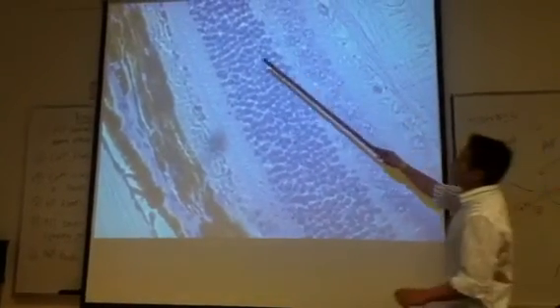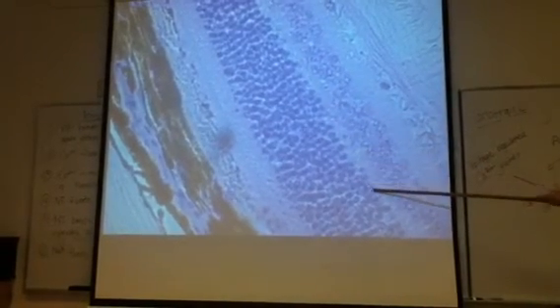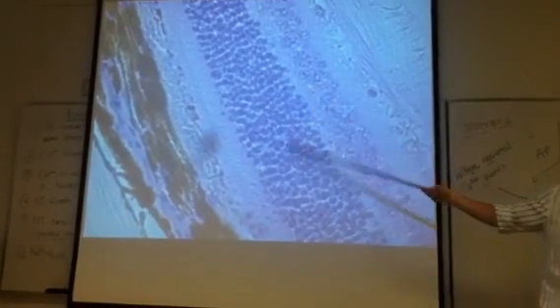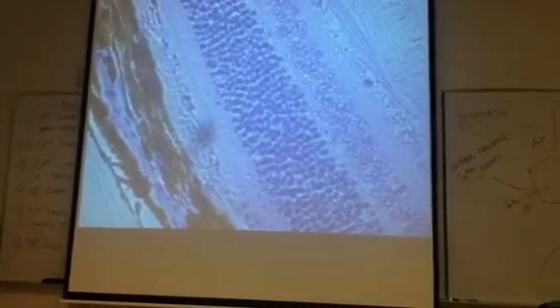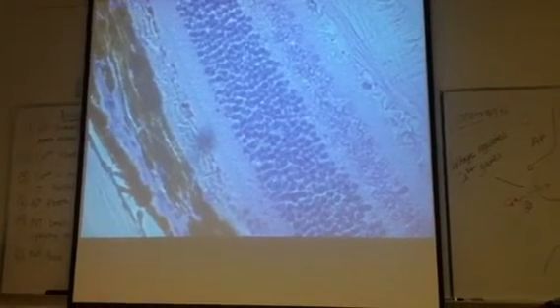Okay. So, you see there's the nuclei of the photoreceptors, the nuclei of the bipolar cells. There's actually a thin kind of layer right here in between the two. That's lighter. That's a lighter color. What structures are found in there? So, the axons of the photoreceptors and the dendrites of the bipolar cells. Yes. So, in this region right here is the axons of the photoreceptors and the dendrites of the bipolar cells. Or we could say it's the synapses between the photoreceptors and the bipolar cells. Right? When they're synapsing.